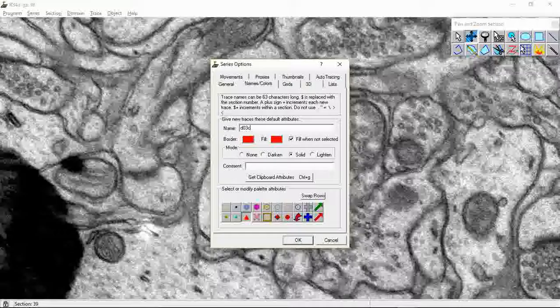And then you want to put P, which stands for your P stamp, and we will start off using 01. And these numbers correspond to which protrusion you are referencing. Each protrusion you will use the same name stamp. However, once you come upon a second protrusion, then you would change this last number to 02.